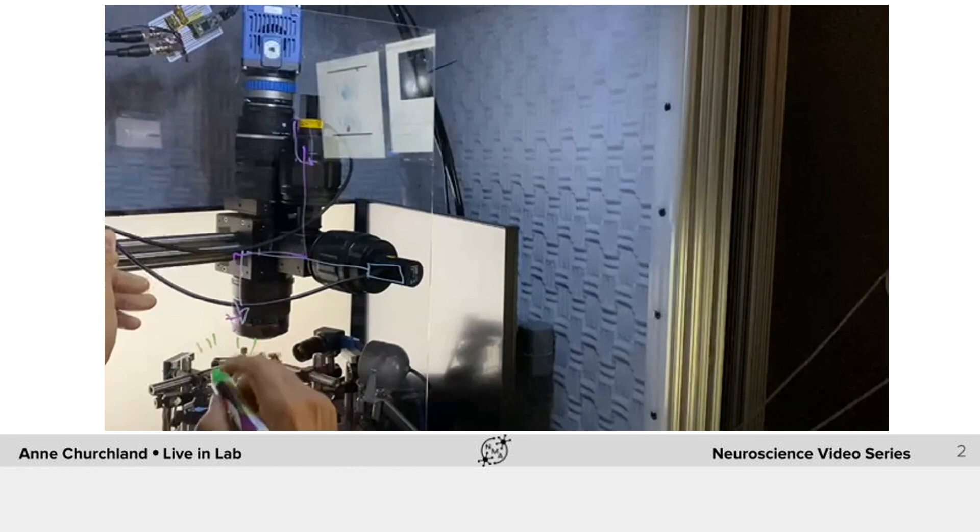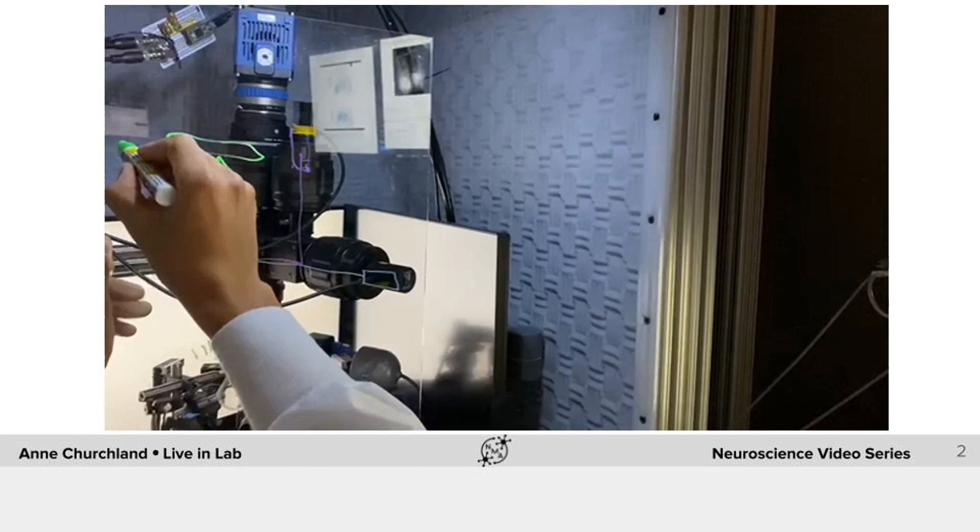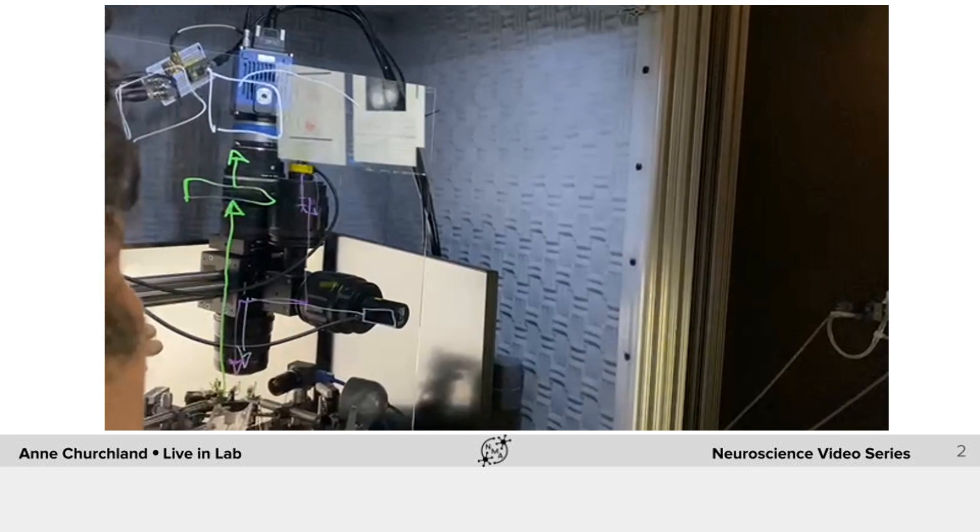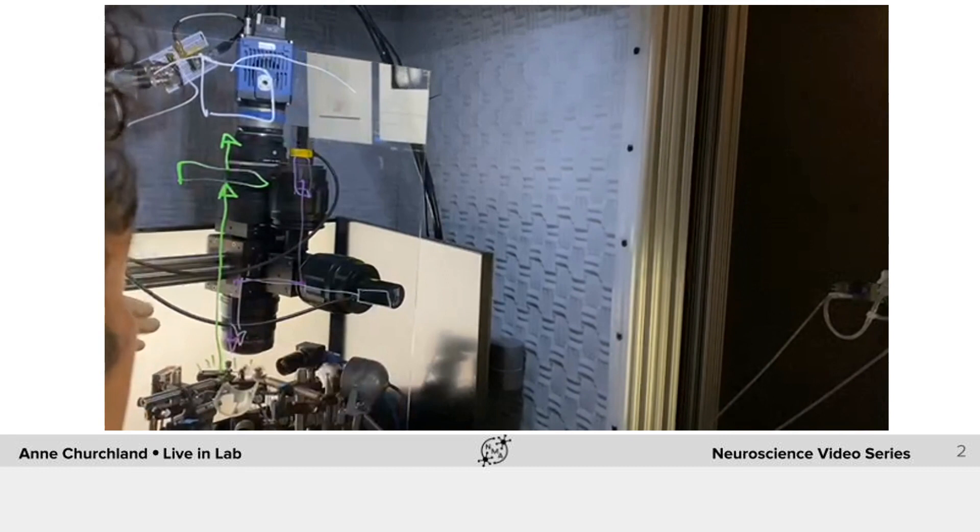And then when light reaches the cortex it excites a GCaMP that sends green light back. So we have a filter where the light passes through and it goes straight into a camera that we can use to then acquire data. We use some tricks to synchronize data and to make that the lights alternate on and off between the two different wavelengths.